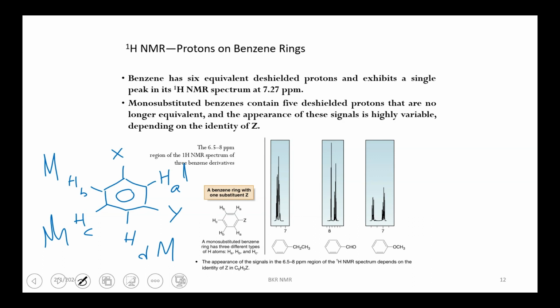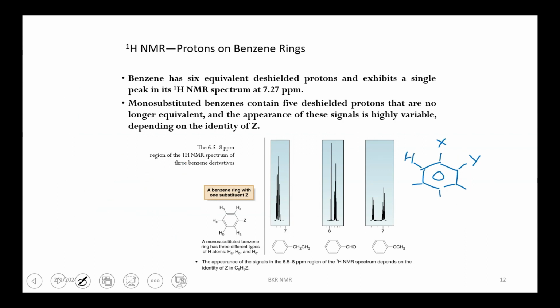So when you have doublet and doublet, be sure that you have the para isomer. Ortho isomer will also give you more number of signals. So when I take the ortho isomer, four different types of proton: doublet, triplet, triplet, and doublet. So more number of signals.